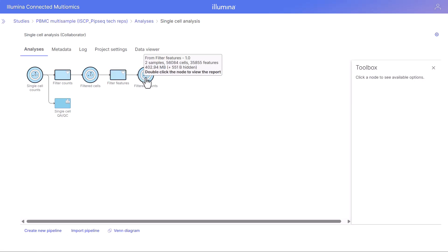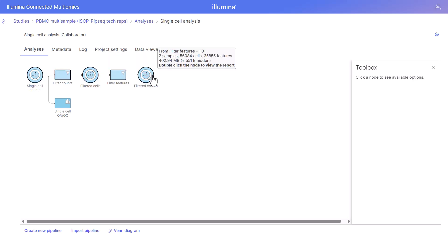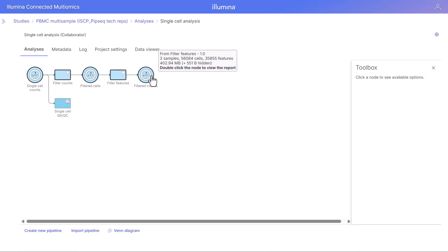The filter features task has completed. When we hover over this node we can see the number of cells from our filtered cells task as well as the number of features from the filter features task. Both of these steps are optional. There's no gold standard for what makes a gene informative or not, and the ideal filtering criteria really depends on your experimental design and research question.